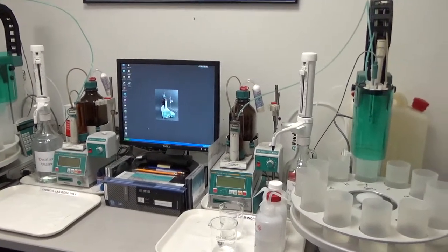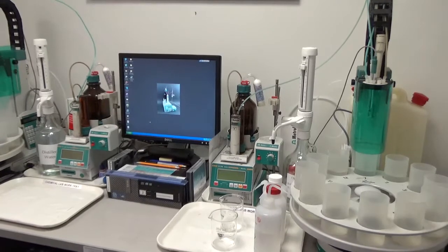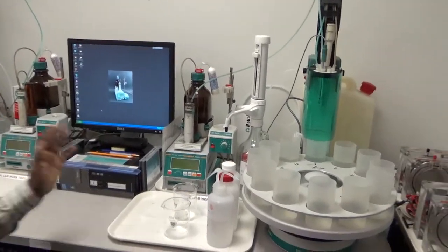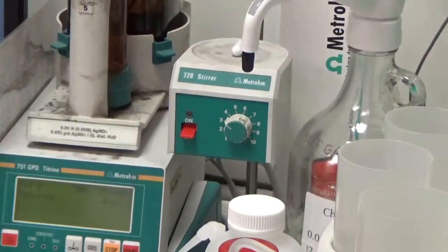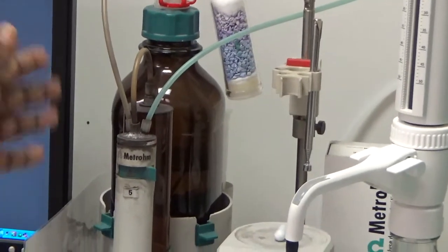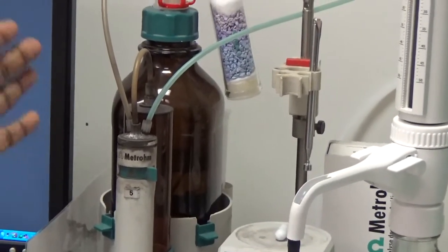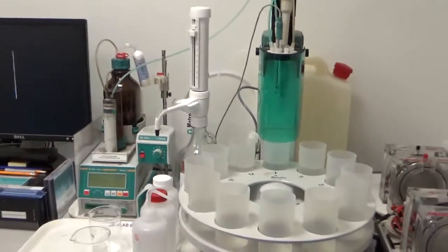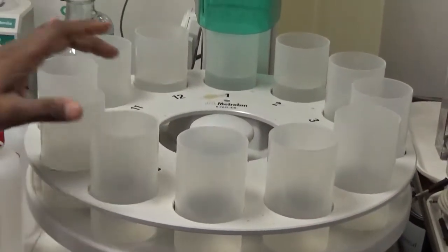Here we have two setups to show how we do the chloride content analysis on the filtrate after digesting the concrete in acid or water. This is a Metrohm setup — a Metrohm 751 GDP Titrino with 728 stirrer, and we use a 5 milliliter exchange unit which has an amber glass bottle to contain the silver nitrate titrant. We use amber glass to prevent precipitation of silver.